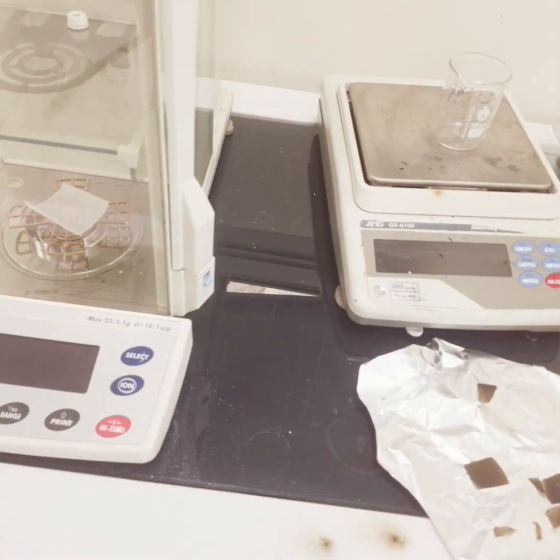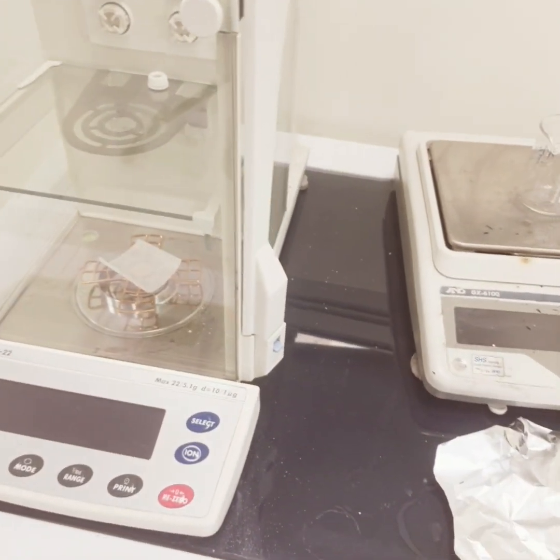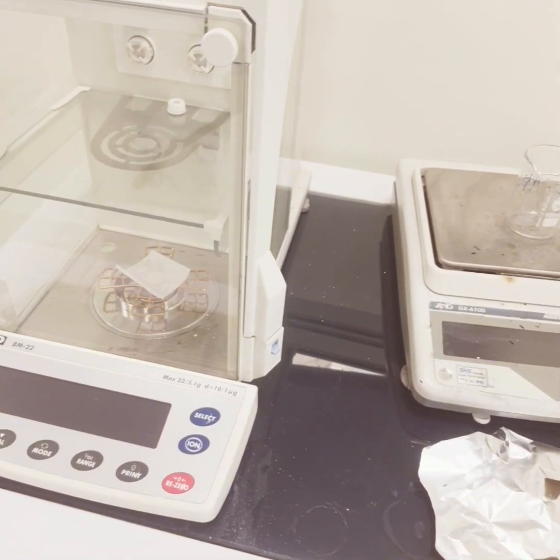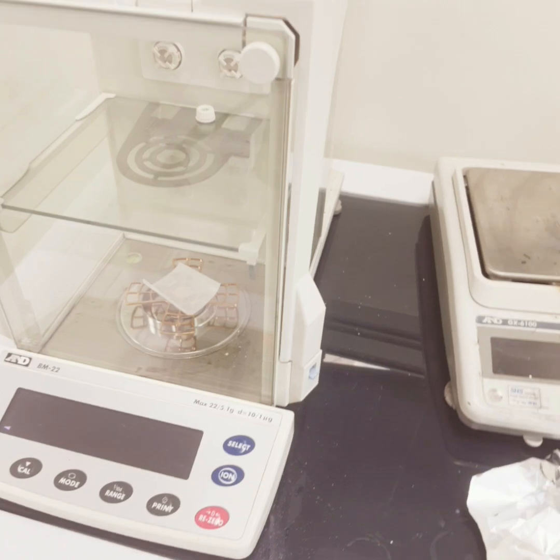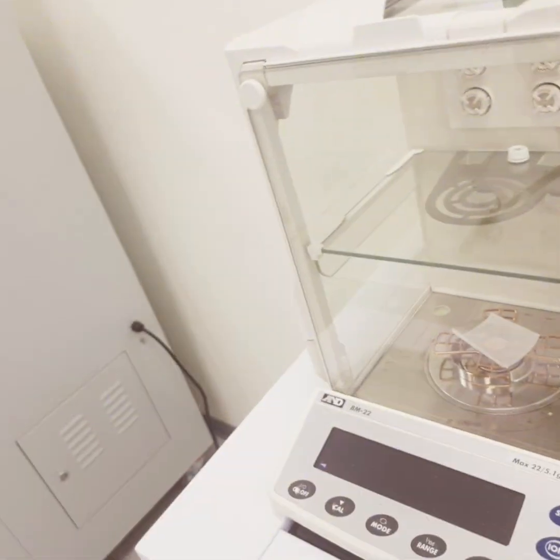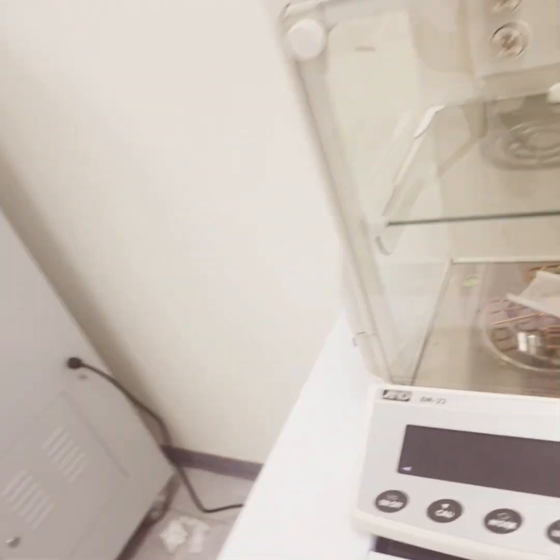And then you will get to know which is more dominant - is it the OH radical or other radicals are more dominant. So this is the checking of scavenging of these dye using certain kind of eluent or solvent.